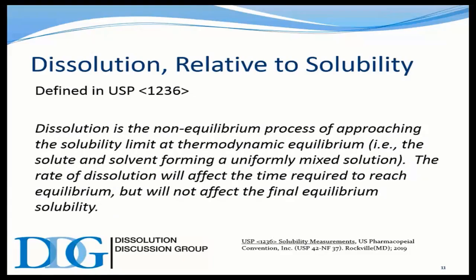So dissolution is a non-equilibrium process of approaching the solubility limit at thermodynamic equilibrium, and this is a point where it's uniformly mixed. The rate of dissolution will affect the time to reach equilibrium. It will not affect the final equilibrium.